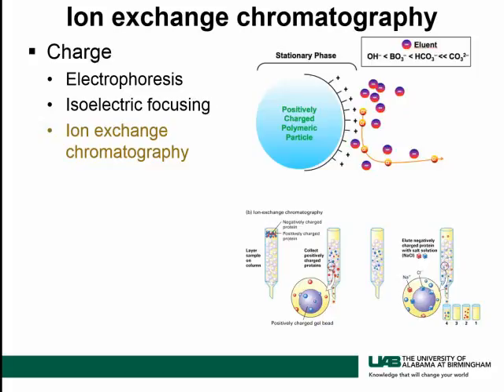You're going to run the buffer with the pH to make sure that at that pH your protein is negatively charged so that it can bind to this. Now, you wash it and all the other proteins are now falling off of the column. Your protein and maybe other proteins that are negatively charged will be bound to that column.